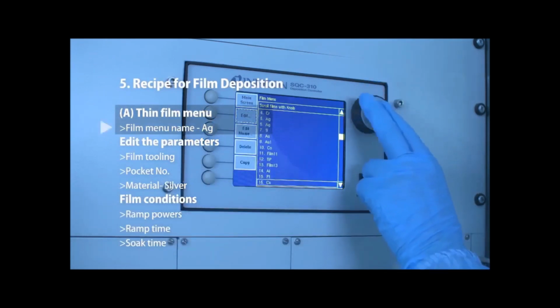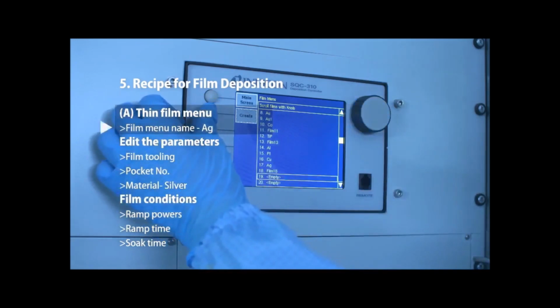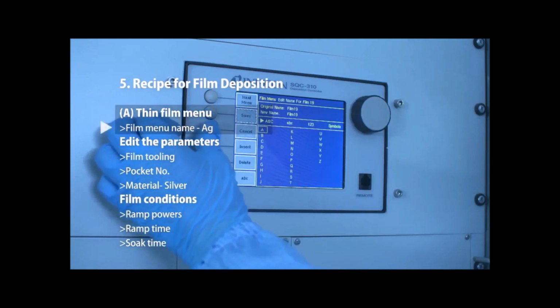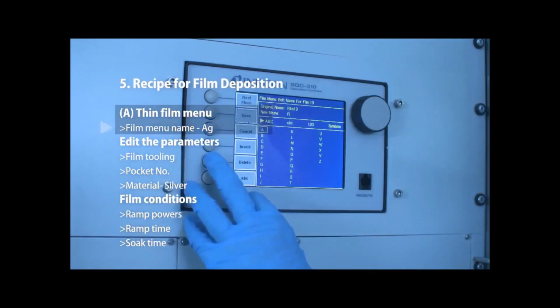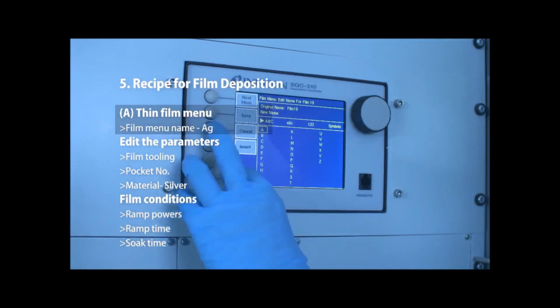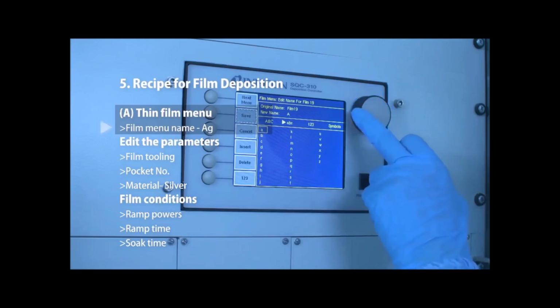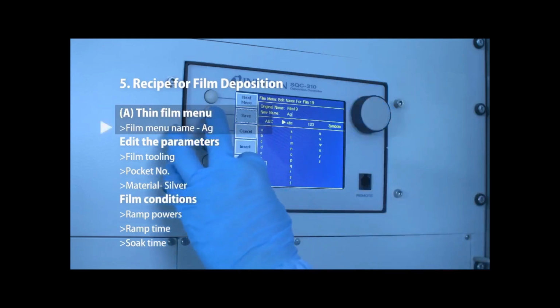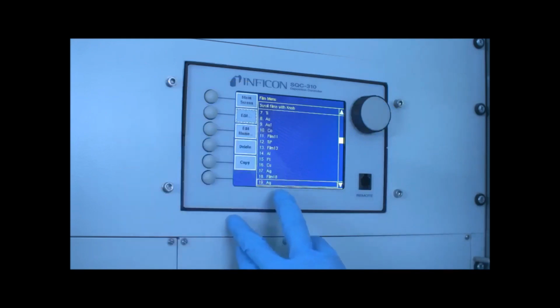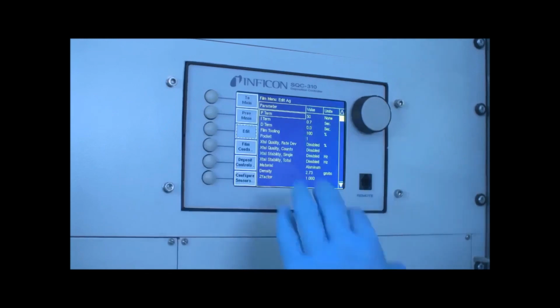First choose an empty film menu. We have to push create, edit name. Let's try to deposit silver. So put AG here, inserting a small g. Let's save the name. The name has been created, so now we have to change the parameters here.